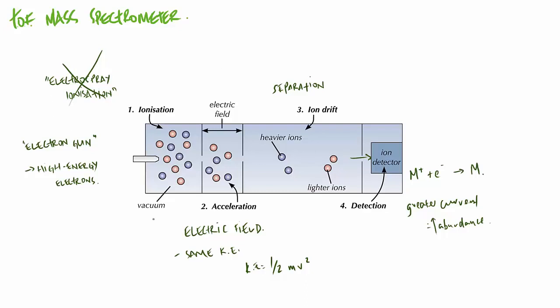That is how the actual layout of it works with its 4 stages. You are expected to be able to describe what's happening at each of these 4 stages, so don't miss that out. That's a very, very easy one. They likely pick out a couple in an exam. They would say describe how the sample is ionized and then detected, something like that.